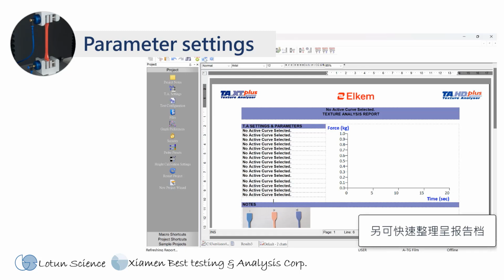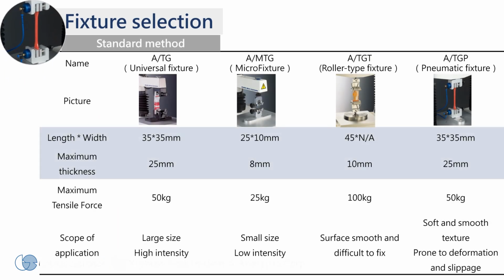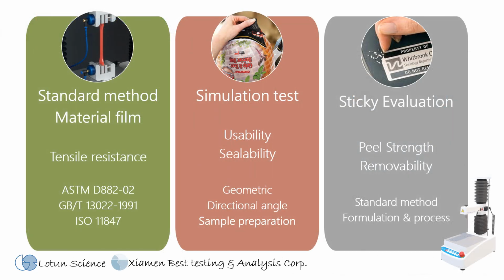Custom reports can be generated. Many types of fixtures can be used for standardized tests. But do different fixtures make a difference? Let's explore the categories and features of various fixtures. After reviewing standard methods, let's move on to the second part, simulation testing.